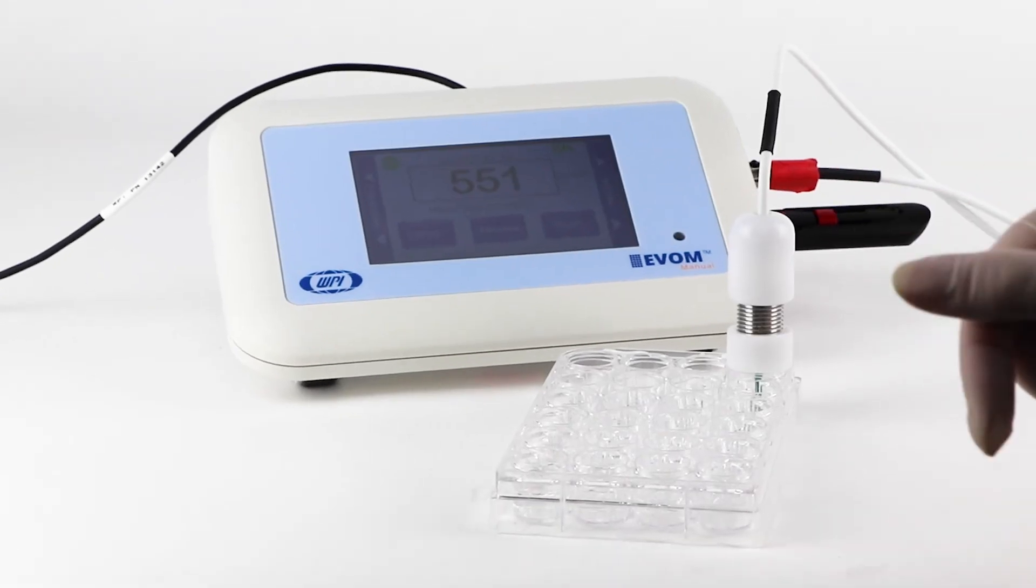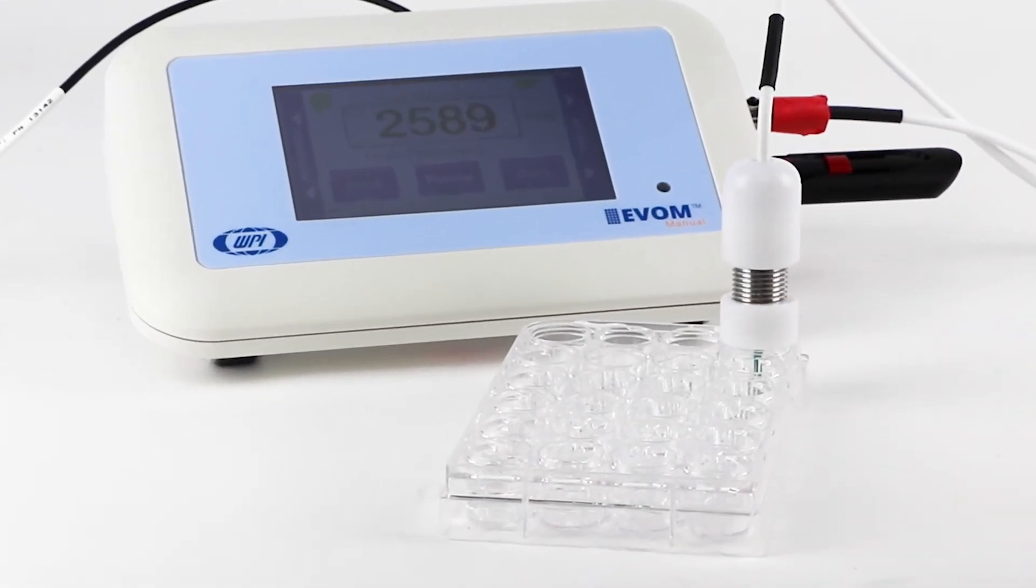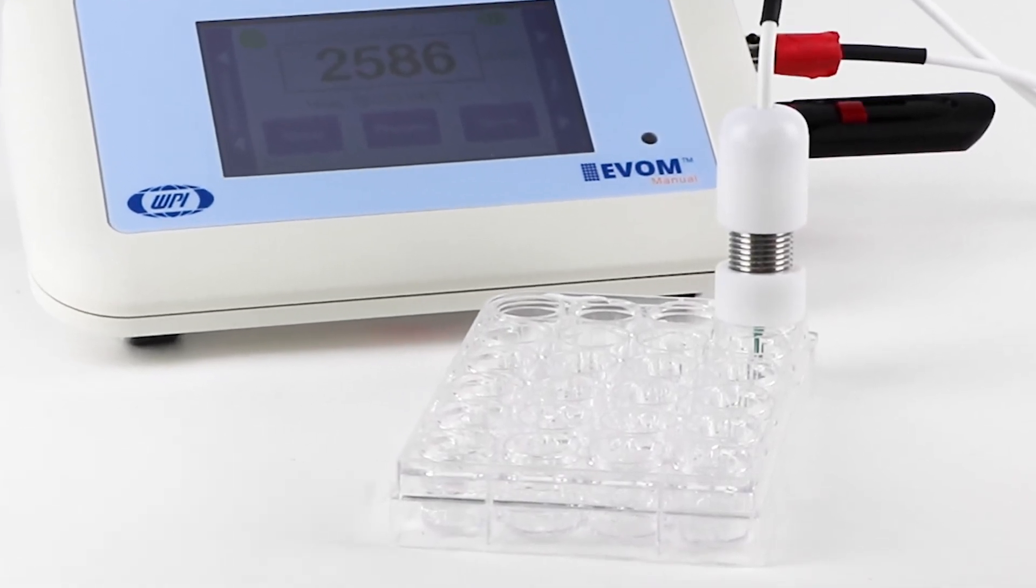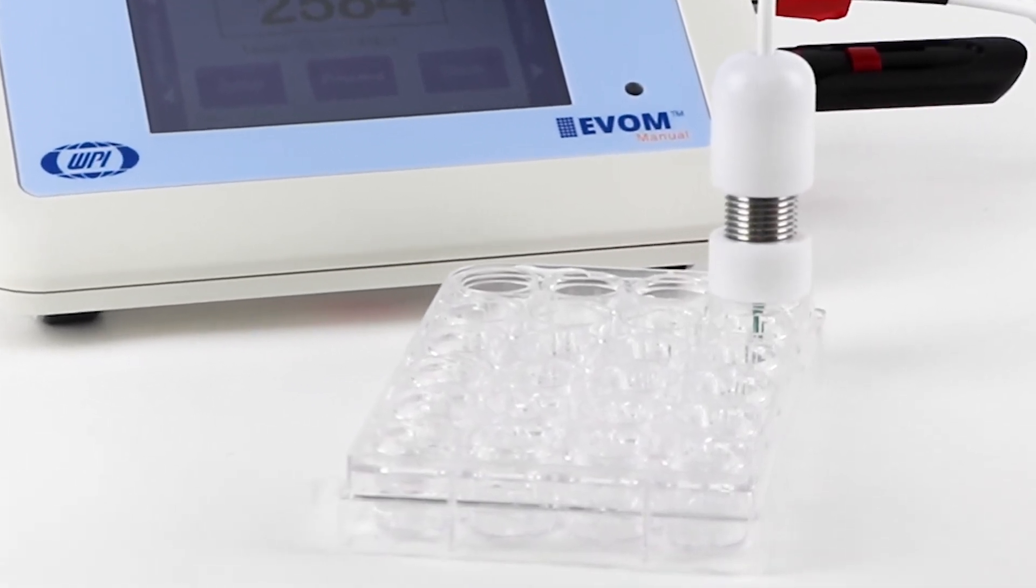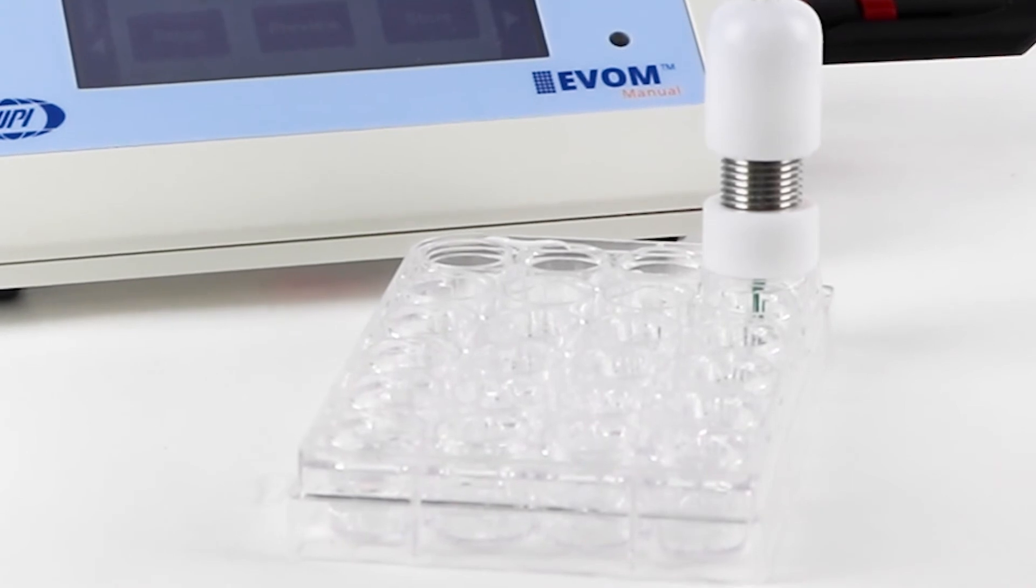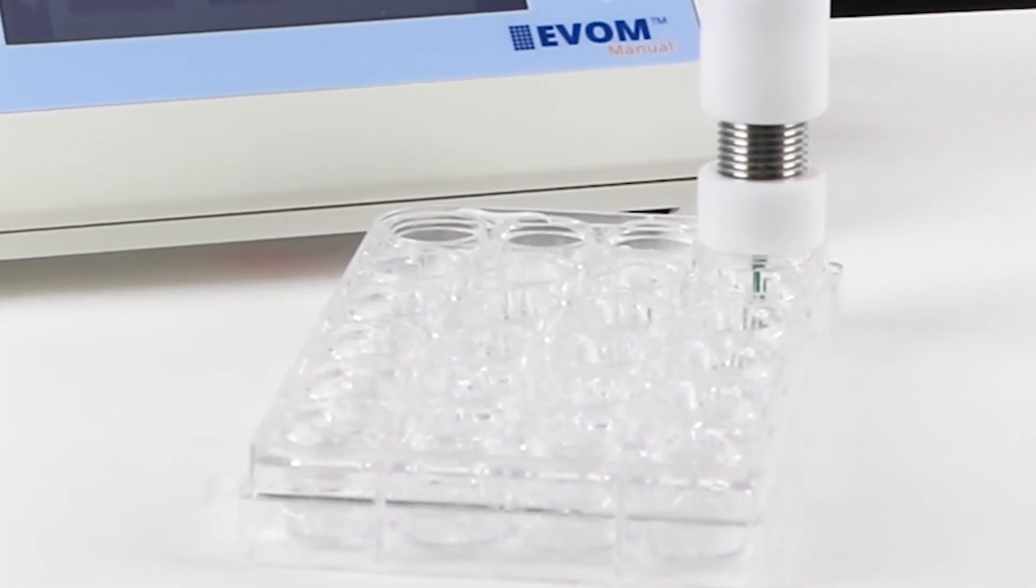The blank is the resistance value of a trans well with no cells, only media. Subtracting the value of the blank gives you the value of the resistance of your cell culture.